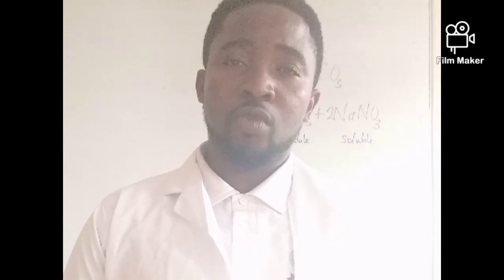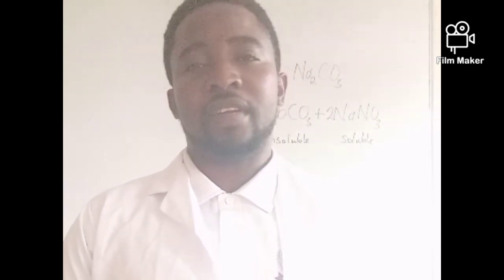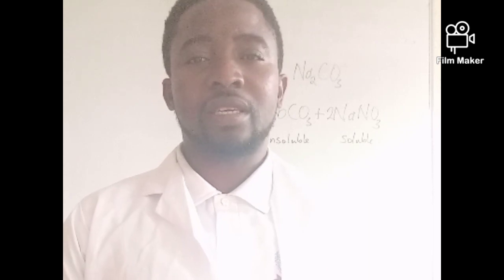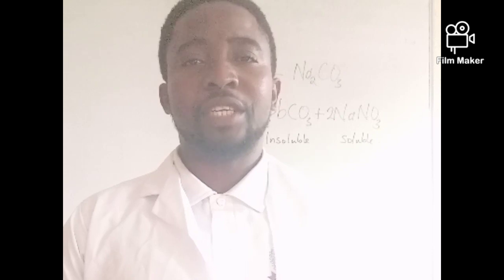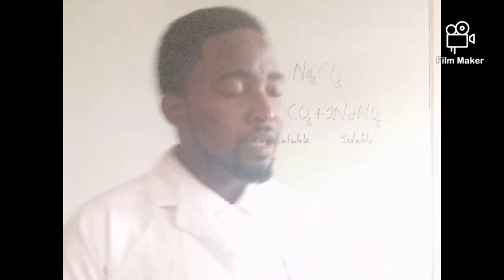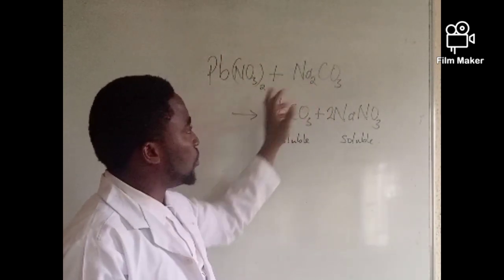Today's video, I will be taking you through the analysis of the salt specimen for this year's WASSCE Chemistry Practicals Qualitative Analysis. So remember that we have two salt samples that will be mixed in the ratio of 1:1, and that is lead nitrate and sodium carbonate.